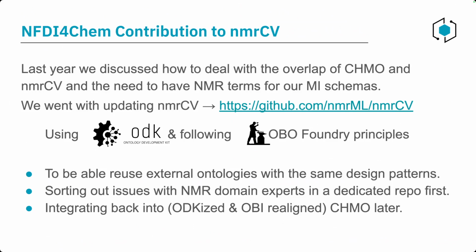So the workflow here is that we have some issues in nmrCV. We go and discuss them with field experts. We provide the solution in nmrCV, and this solution is then possible to be re-imported or exported to CHMO.